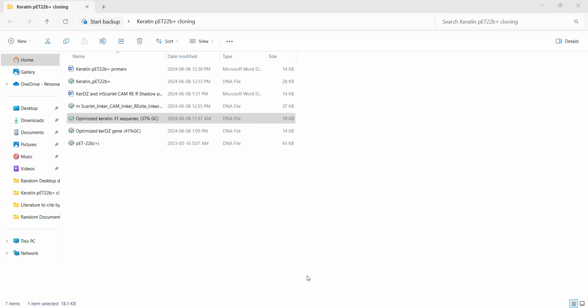I never went below, but I always try to make sure that extensions have similar TMs, even though that TM does not go into the annealing temperature. And sometimes it's not possible to ensure that extensions have similar TM just because there are different GC and AT content at the 5 and 3 prime side of the DNA.